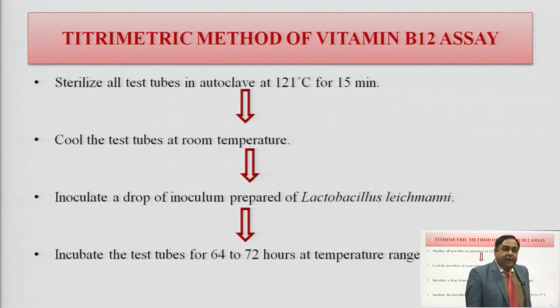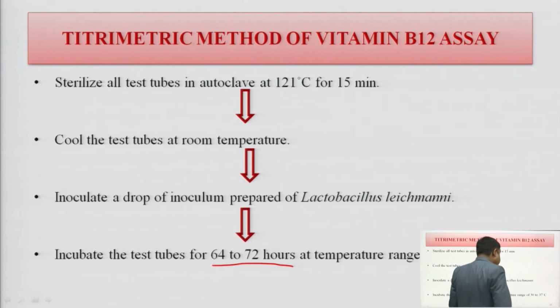Now, after you add this inoculum of Lactobacillus leichmannii, you allow it to grow by providing a favorable atmosphere in an incubator. So, you have to put all these test tubes in an incubator for 64 to 72 hours, maintaining a temperature of 30 to 37 degrees Celsius.